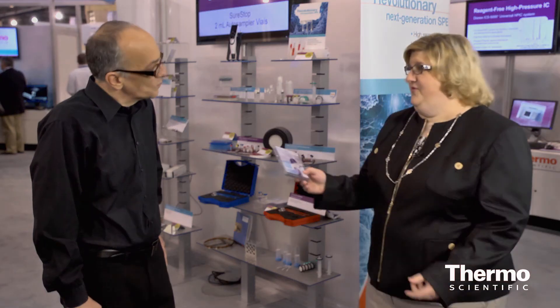In evaporation testing we find that this actually performs as good as a crimp top vial, which means that this vial can actually be used both on GC and on HPLC. Our new SureStop product line is part of the AVCS and part of our full complement of sample handling portfolios, and can be found at thermoscientific.com/SureStop.